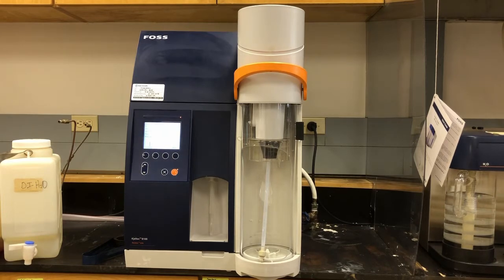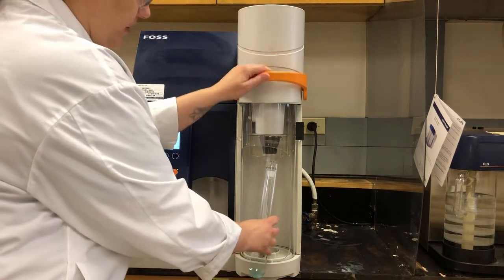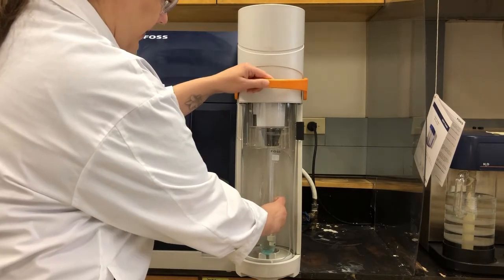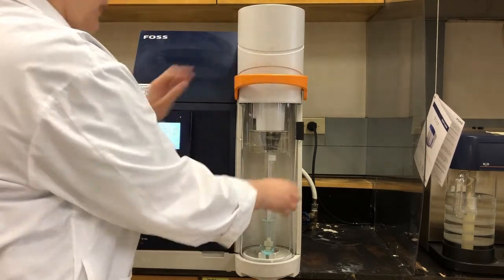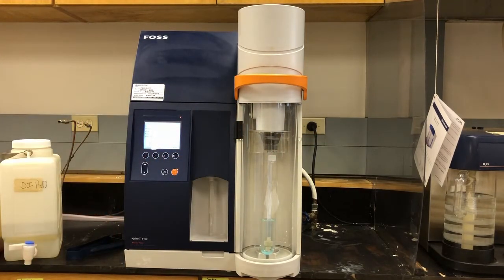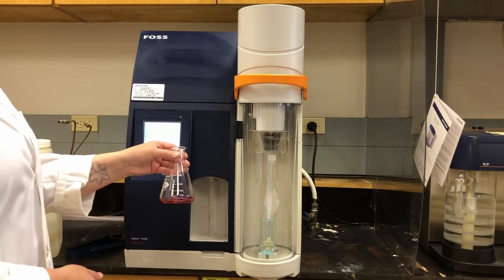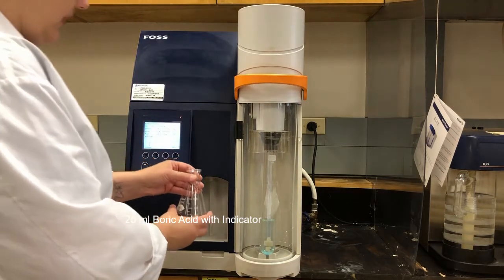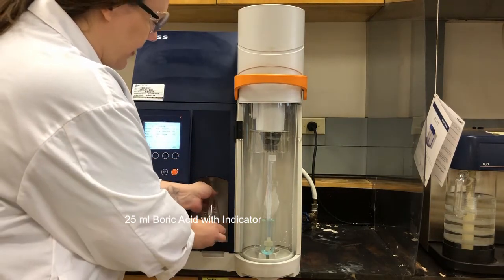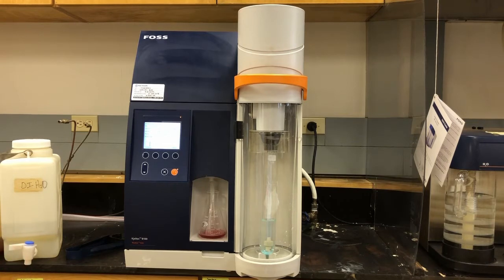When we put our sample on, our sample tube fits in here. And this tube that you see in the middle is the tube that supplies the steam. Make sure that's in there nice and secure. It has a safety door so that if there's any splashing of alkali or anything, it stays contained within the apparatus. This is our receiving flask, and in this flask is 25 milliliters of boric acid, and it also contains an indicator. There's an indicator in there that will change color when the end point of our reaction is reached.